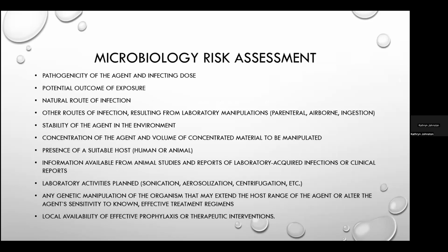So the primary risk assessment that's done in laboratories is the microbiological risk assessment, and it is the backbone of laboratory biosafety. Risk assessments should be completed by persons that are knowledgeable about the organisms being handled in the laboratory.